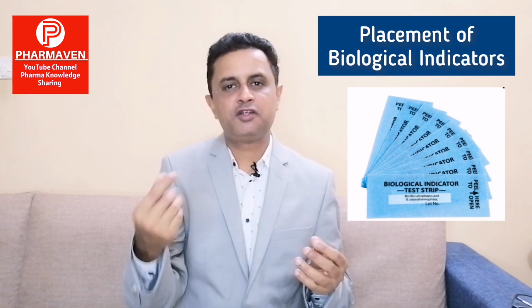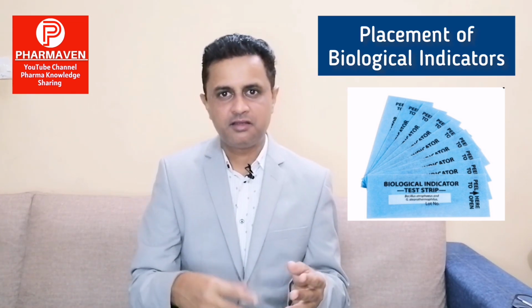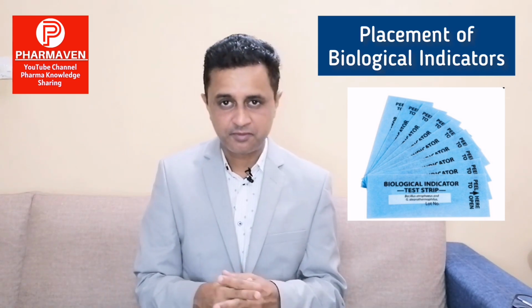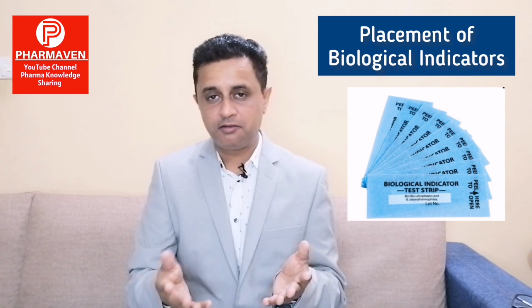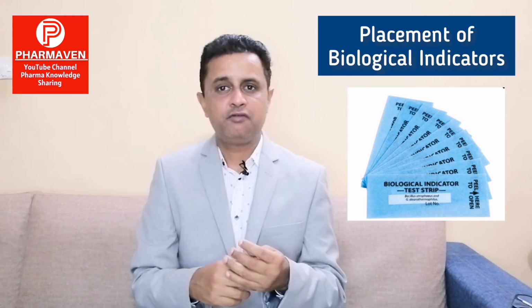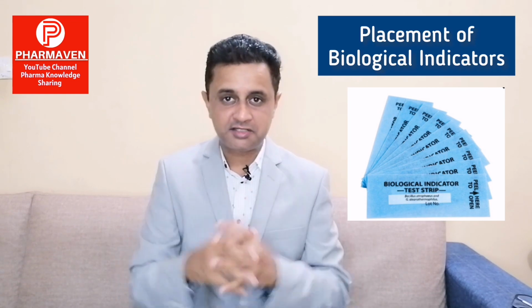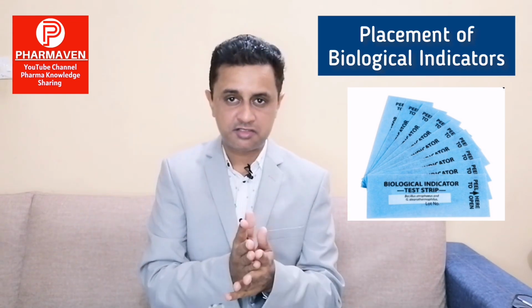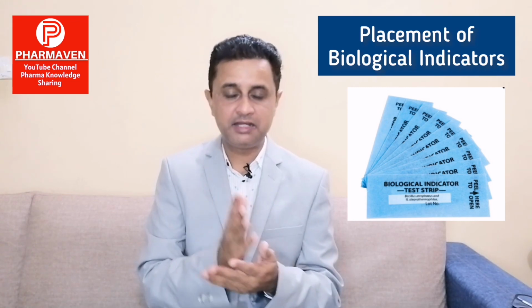In one of the tubing you put the BI, and in similar tubing you put a thermocouple sensor, so that we can correlate. Or just put the BI with the thermocouple, or we may want to use certain accessories with which you cut the silicon tubing into two halves, put biological indicator inside, and then connect the assembly.